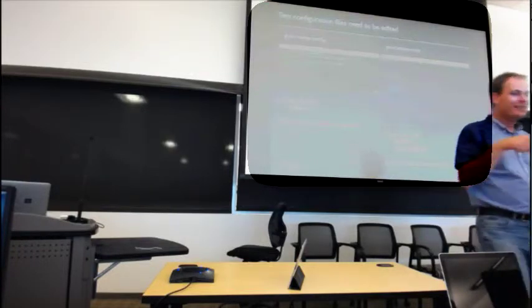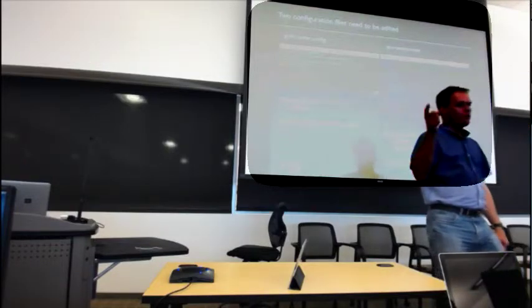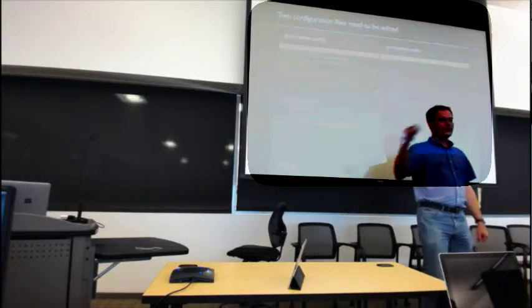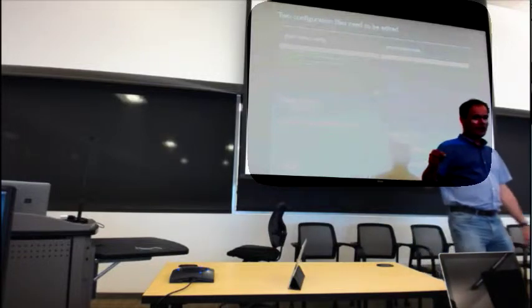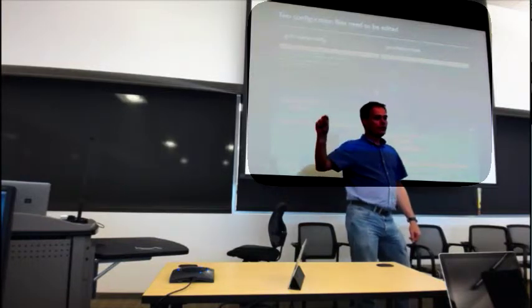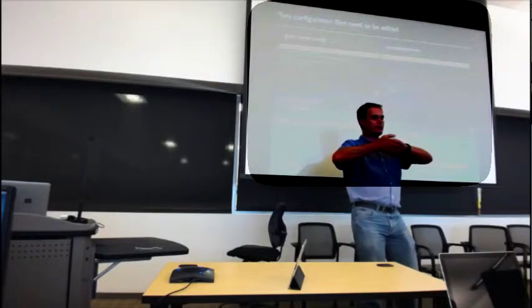Ah, okay. But I expanded it in my home directory, if this is fine. That should work. The problem with the home directory is it's not as fast a disk system, but it will work. And also there's a quota on that, so you can rapidly fill up your quota with experimental data. So it is actually better to use the Scratch directories in principle. Of course. That's a workaround. The thing is, if you can't actually write to the Scratch, you might not be able to see the data because those two permissions are linked.